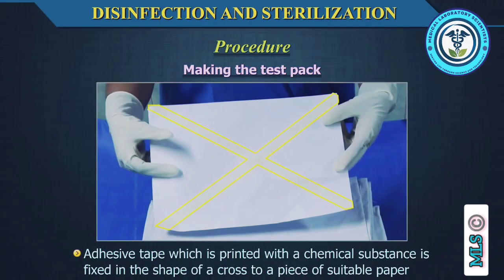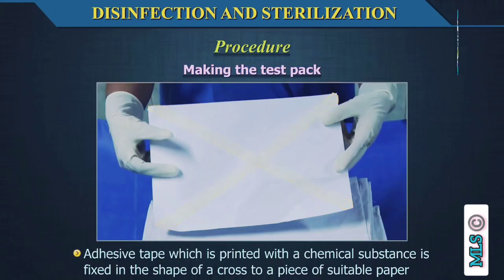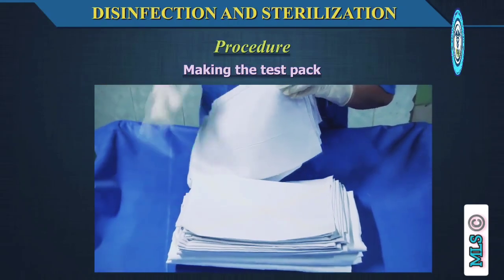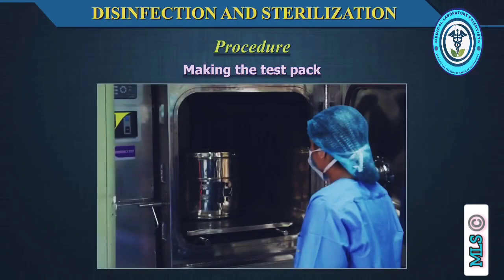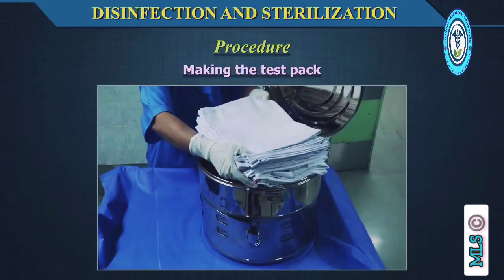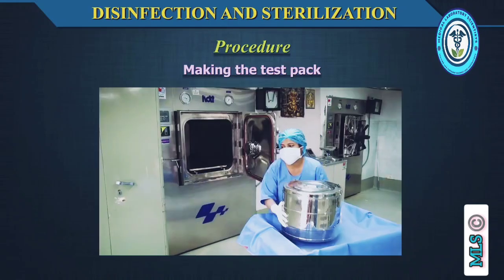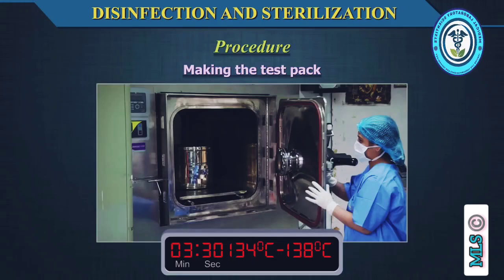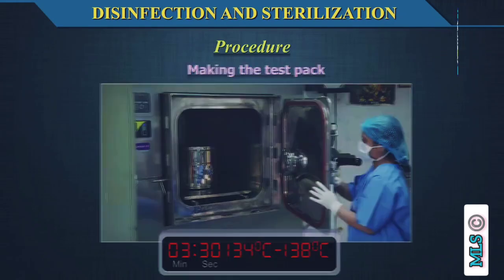An adhesive tape, which is printed with a chemical substance, is fixed in the shape of a cross. This test sheet is placed in the center of a stack of towels. The test pack should be placed on the longitudinal center line of the chamber 10 cm away from any door and 10 cm above the chamber base of an otherwise empty sterilizer. The towels should be lying horizontally. It must be subjected to a standard sterilizing cycle. The holding or sterilizing time should not be more than 3.5 minutes at a temperature of 134 degrees Celsius to 138 degrees Celsius.